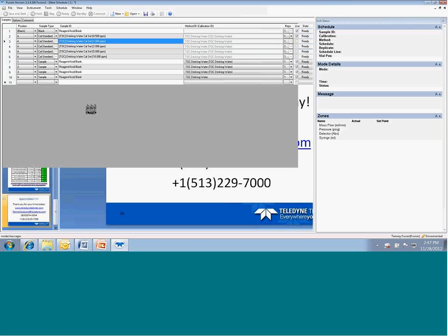The reports can give you all the information as metadata. You can export that to an Excel file or a CSV file. A lot of times, if you are calling into us and we are helping you improve your methodology or optimize your parameters, we'll have you export it to a file, which you're currently doing, and email it to us. Then we'll be able to take a look at it and say, maybe we can make some adjustments here or there depending upon the application.